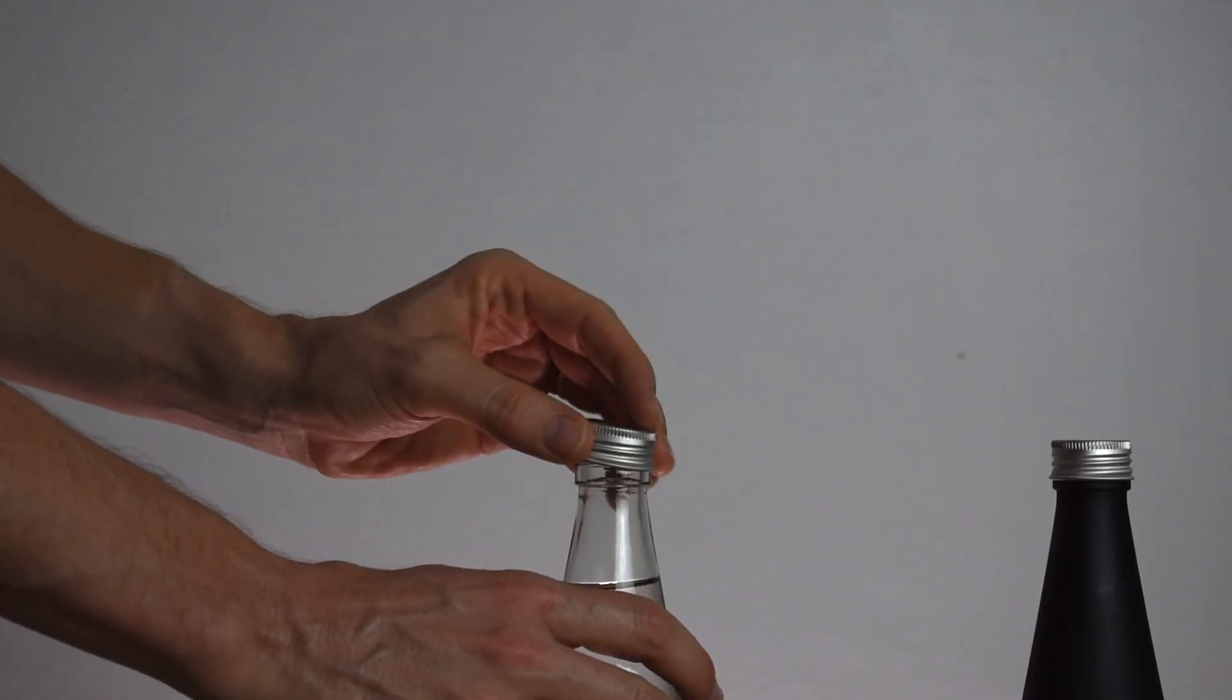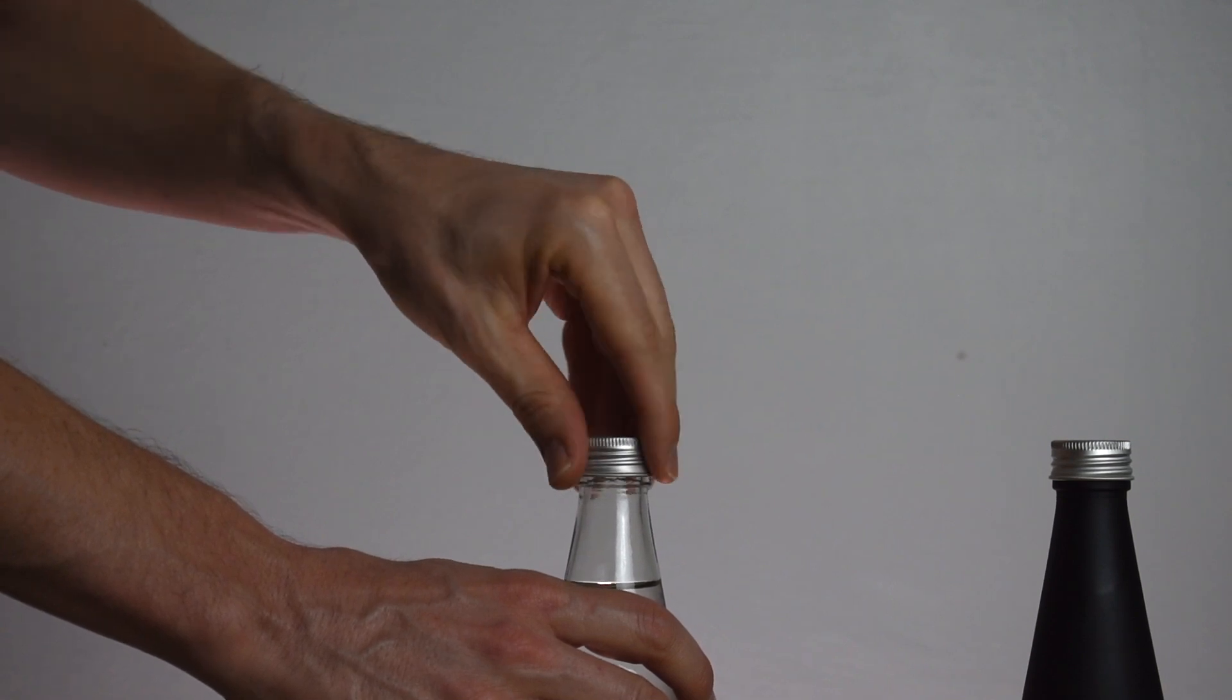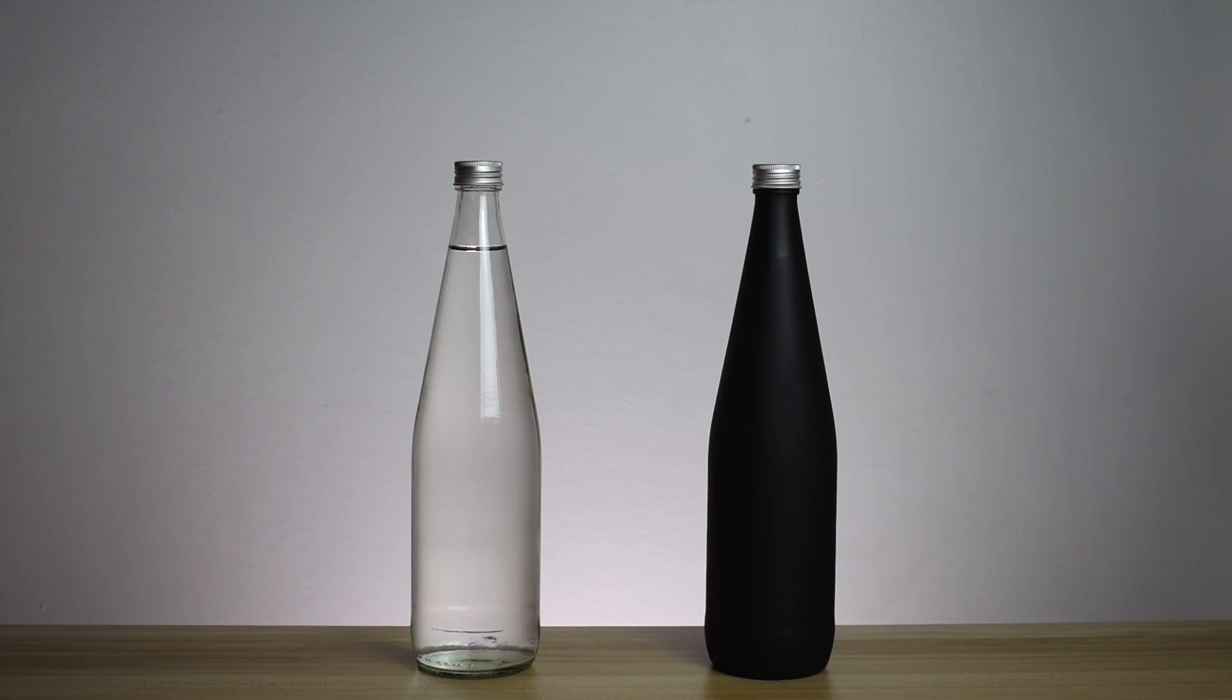Next, seal them airtight so that no gases can enter or exit the bottles. This means that any changes in gas levels are only the result of photosynthesis and respiration within the bottles and not from gases entering or exiting the systems.